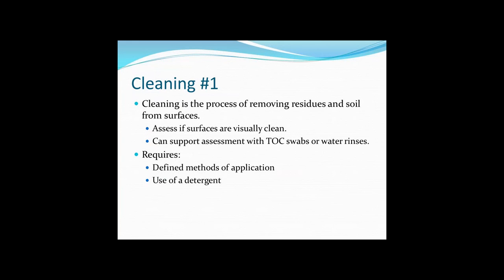Okay, so what is cleaning and how does it differ from disinfection? Well, cleaning is the process of removing residues and soil, so that's dirt, dust, protein, bits of skin and so on, from surfaces to the extent that they are visually clean. Now, cleanliness can go further, and it can be supported by the use of swabs, such as maybe to detect levels of total organic carbon, or water rinses. And this might be applied more to a piece of equipment, particularly where an item of equipment is being used for different production processes. But in general, for the clean room, a visual assessment of cleanliness is satisfactory.